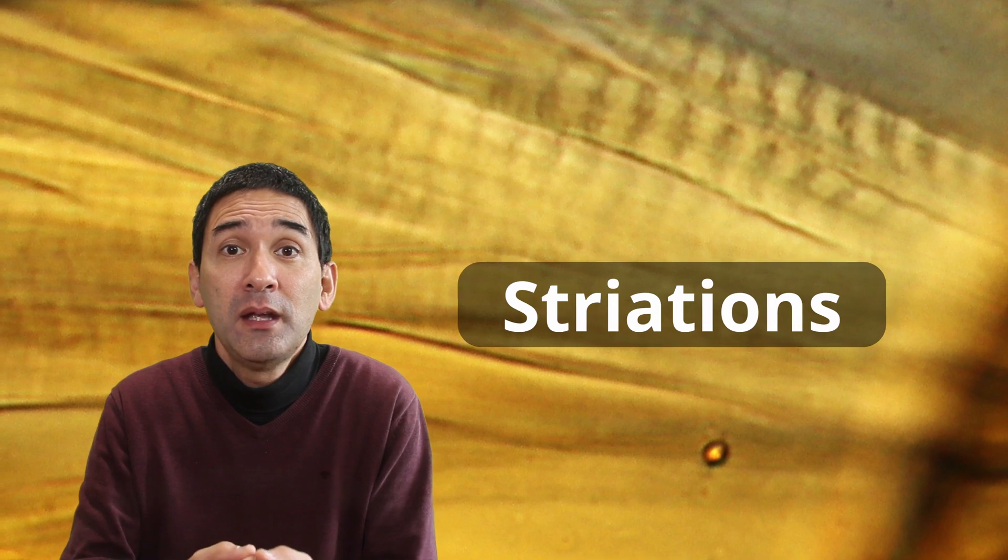This banding pattern is referred to as striations, and if you are able to see these striations under the microscope then you actually know that you're looking at muscles.